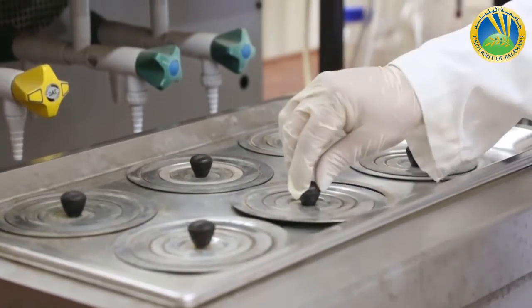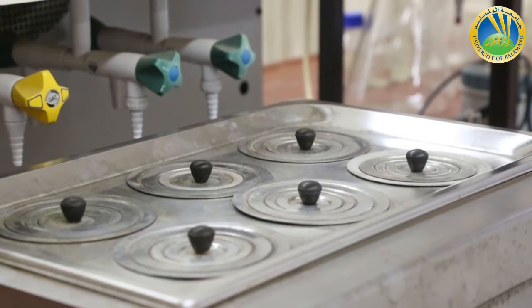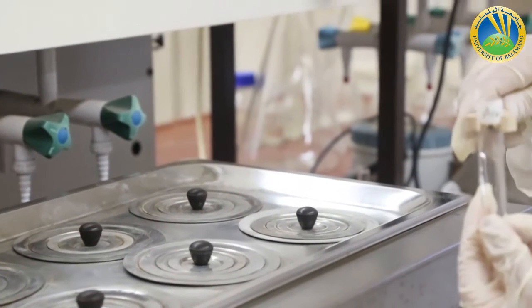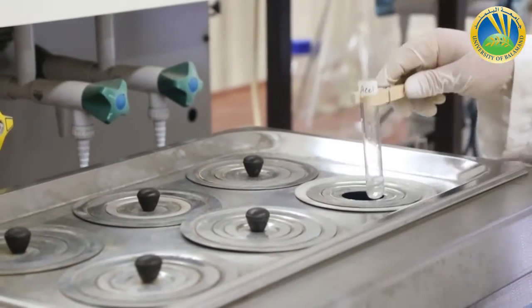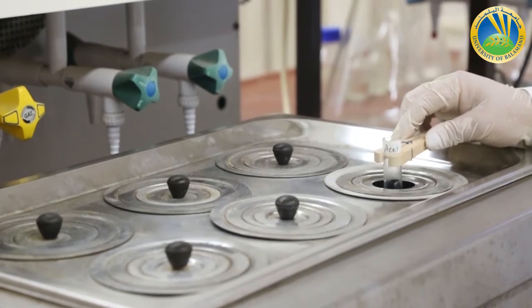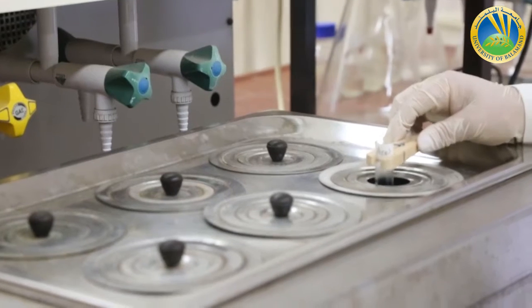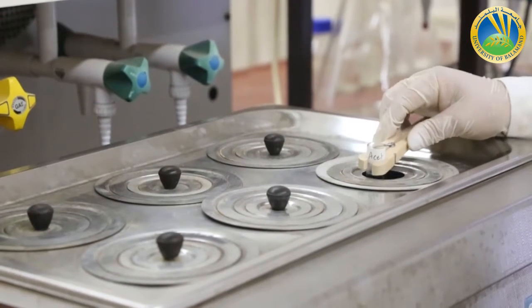We will start to test the solubility of the compounds at hot, at the boiling point of water, which is 100 degrees. Acetanilide did not dissolve at cold, that's why I have to check its solubility at hot. The water bath is at 100 degrees C, so the test should take a few seconds. I'm not allowed to leave the tube inside the water bath and go, because the solvent will directly evaporate.